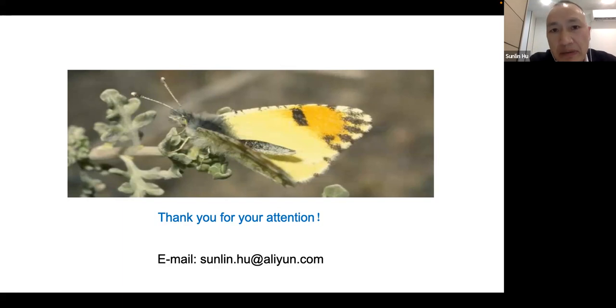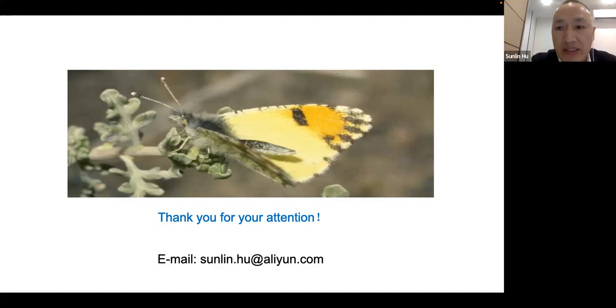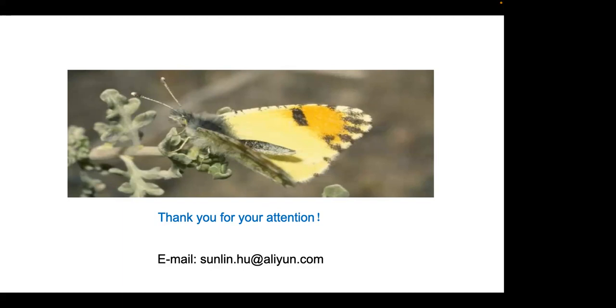We will see if the diatoms detected look the same in morphology. That's what we are most concerned with. Okay, that makes sense. Thank you.